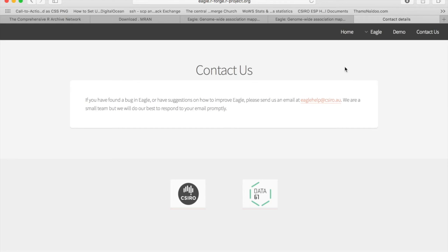We've set up an email account for you to email us with any questions. As I say, we are a small team. It might take us a little bit of time to get back to you, but we will do our best to answer your questions, and especially if you find bugs. We've done our best to test all different parts of Eagle, but it does have many working parts, and some parts have been tested with varying degrees of rigidness. I don't know if that's a word, but anyway, you get the idea. If there's bugs, please email us and we will set things right.